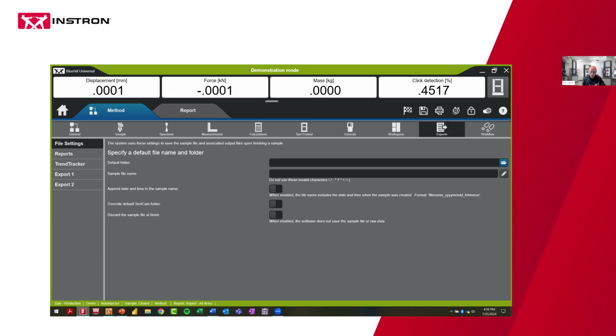And you can set up a system suitability test to say, sure, just run my normal test. I'm going to be using this controlled reference material. You can have your reference, your sample pass-fail criteria specified, and if that specimen passes, meaning that the transducers are seemingly functioning to give us a good modulus, a good yield value or an extensometer strain value, then you can configure those pass-fail criteria as such, and that can act as your check.